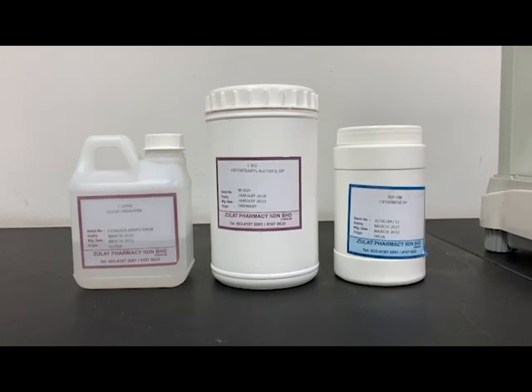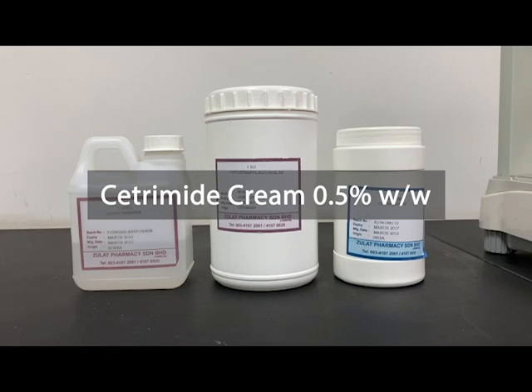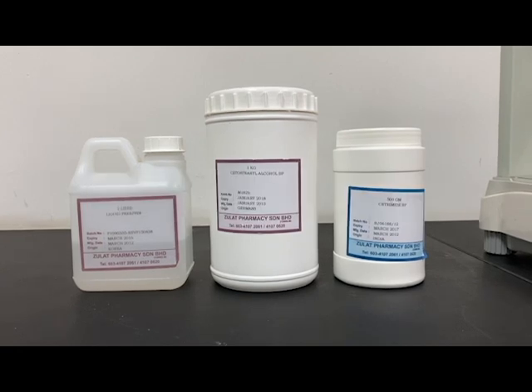Hello there! For this practical session, you will be preparing Cetrimide cream of 0.5% weight over weight. So let's get started.